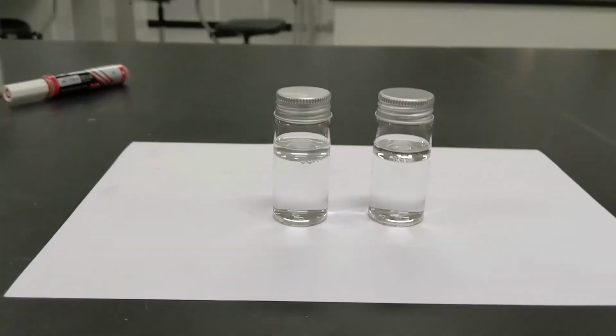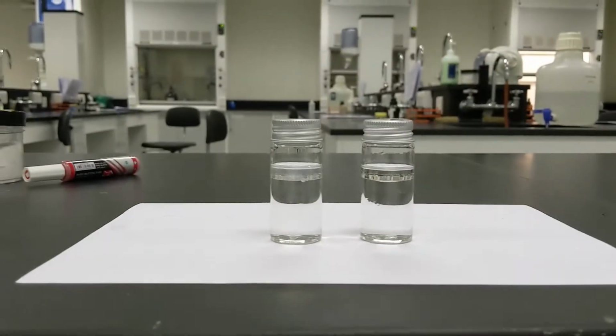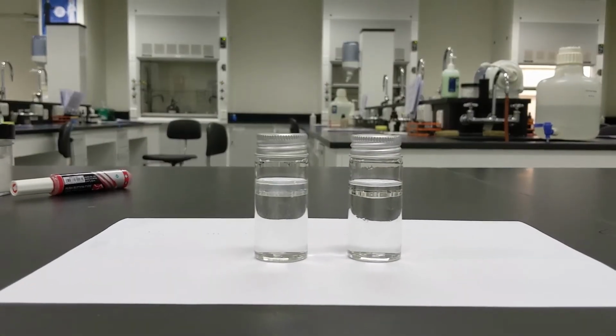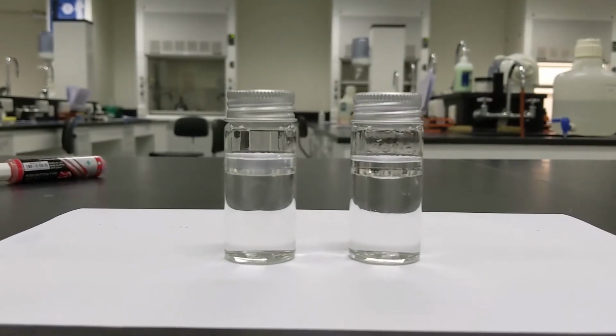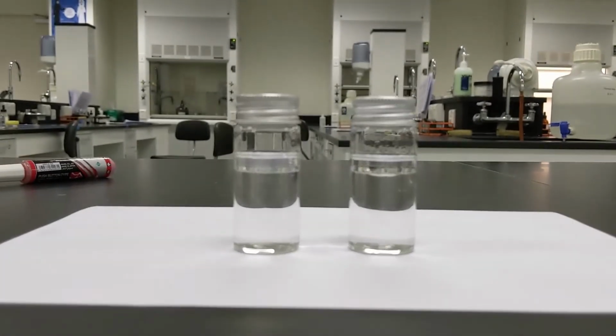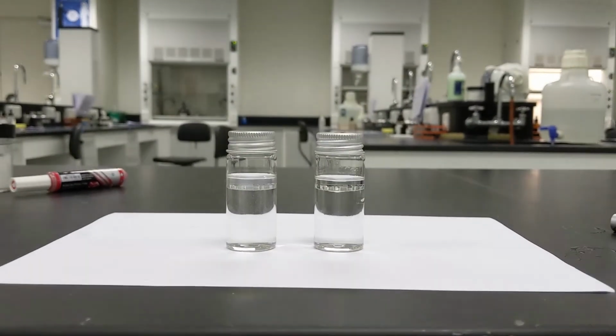Okay, this is part B. There's kind of like a part B and a C, part C and a half kind of coming up here. I have the same mixtures here. I have water and cyclohexane, roughly the same amounts. Cyclohexane is on top, water is on bottom.